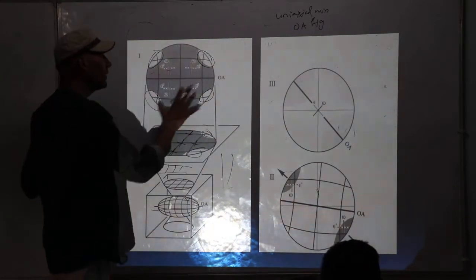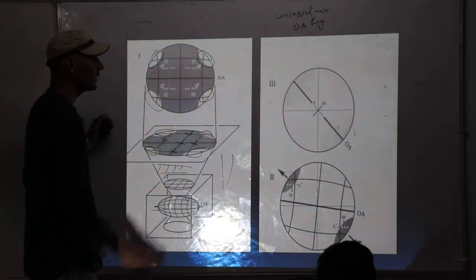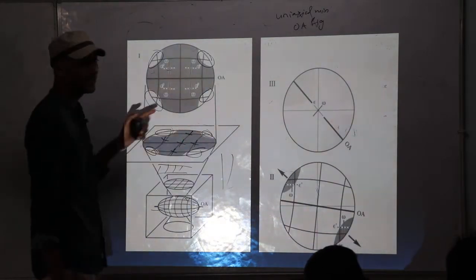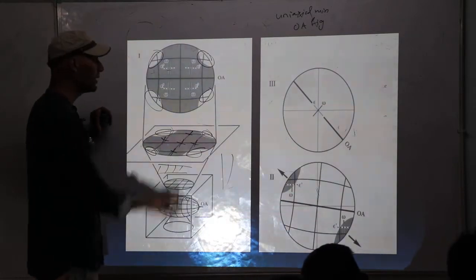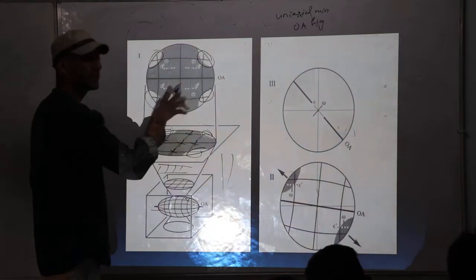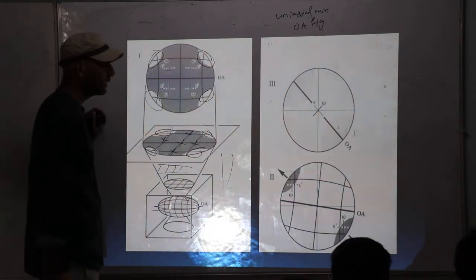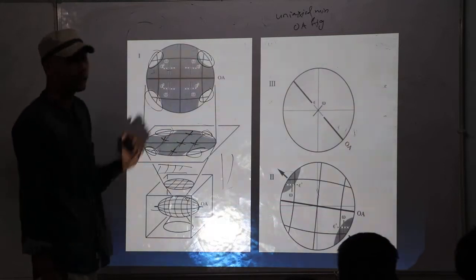In all of the positions, due to the greater radius of the circle, the curvature decreases, so there will be almost straight lines. So the vibrations will match with the polarizer and analyzer. So what happens? The entire interference figure will go extinct, except some portions showing interference color. All of the other portions are going to extinct, so there is darkness.